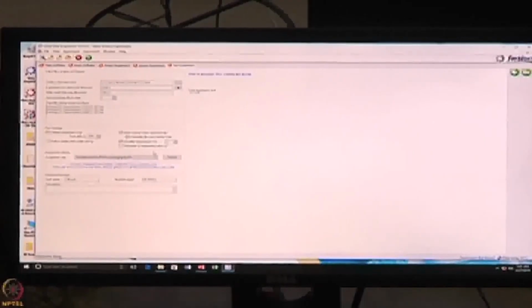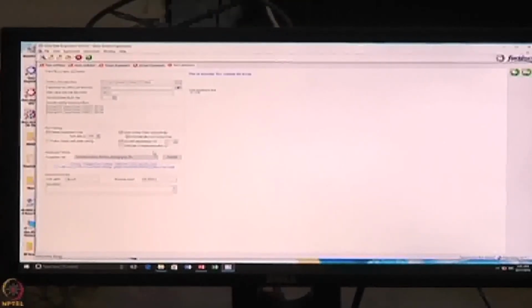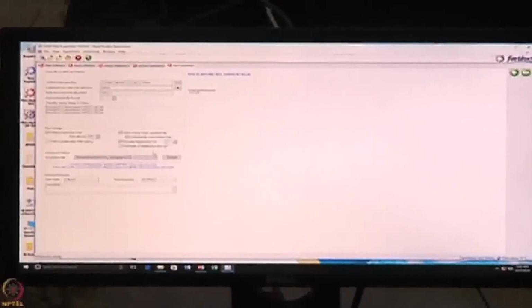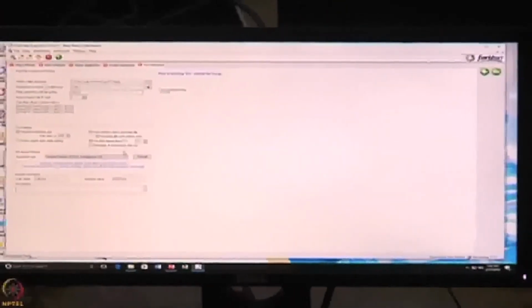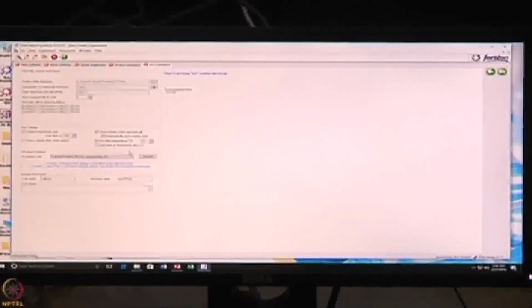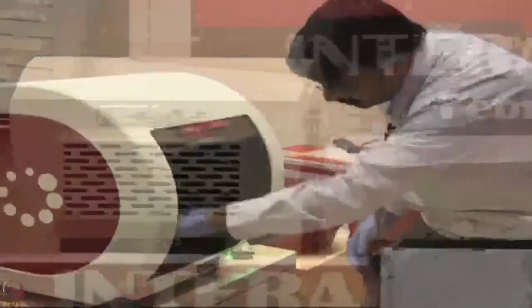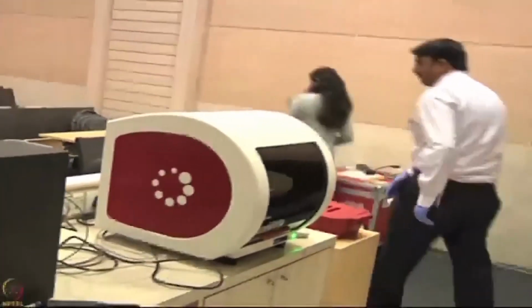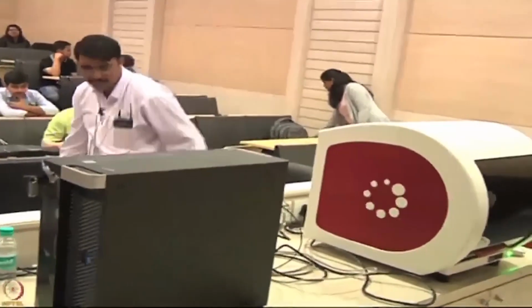So before going to that, we have to place the sensor as well as my sample tray in the instrument, right? So where my sensor tray is here, okay. These are the 7 sensors I am using. I am placing them here. Sorry, I can't show you this one. Once after the experiment, you guys can look into that. I will place it here, and my sample plate. So we have placed both, then we can say go. So when you say go, we have started the experiment.